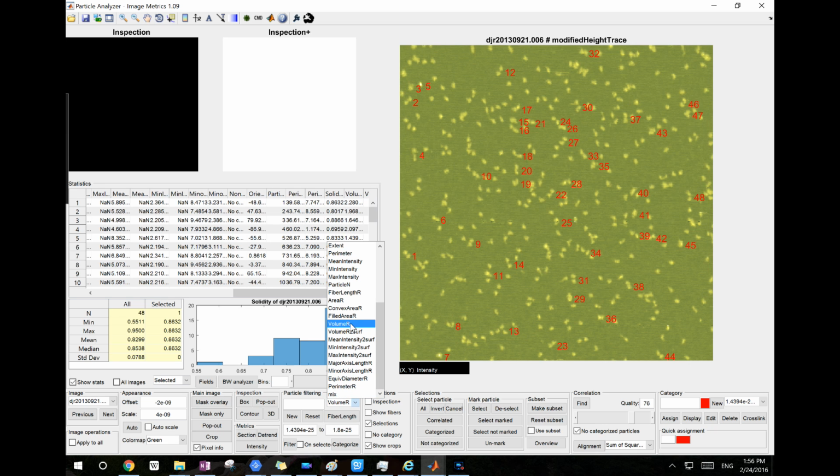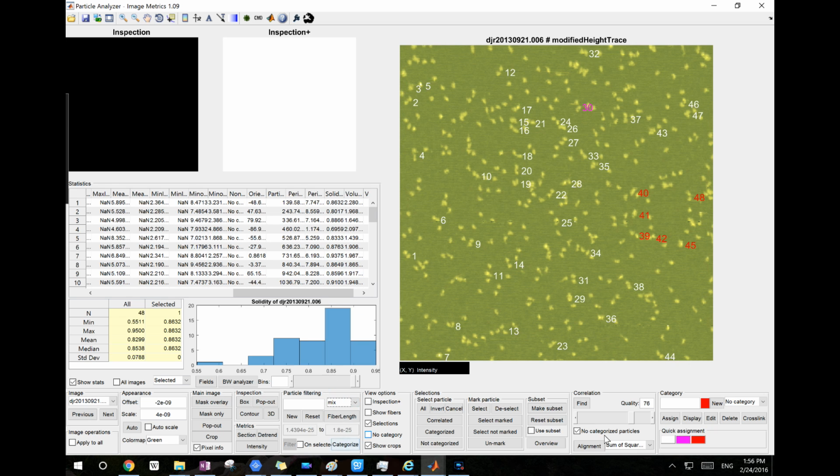It will make the category in the volume filter, but if we go back to the mixed filter, it stays the same category as we already set, because it can't set up the range for volume at the same time when you click categorize. So that's a limit for this method. This button will only make categories under the filter of your choice. It won't make a category under the filter mix. If you want to make a category under the volume, you go to volume and click the category button, but it only makes the category under the filter volume, not under the filter mix.